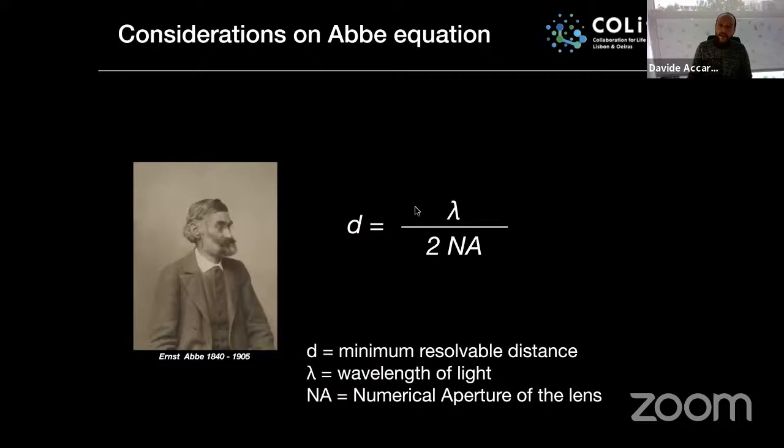But also, if you have a specific structure in your biological sample that is labeled with a certain fluorophore, it will have a certain image and diffraction pattern, but if you label the very same biological structure with another fluorophore that will produce photons with different wavelengths, you will see a different image because it will create a different Airy disk and diffraction pattern, although the structure of the sample will be the same.